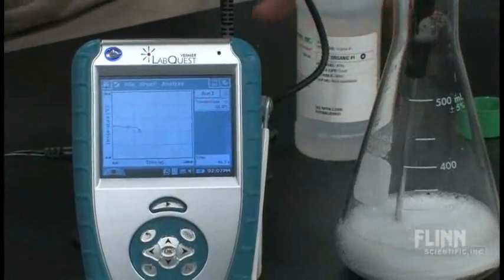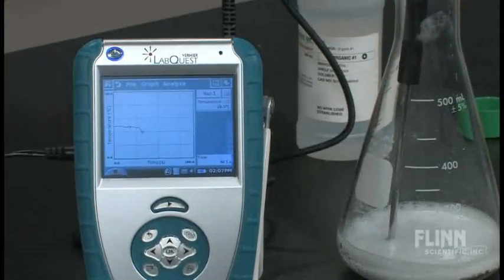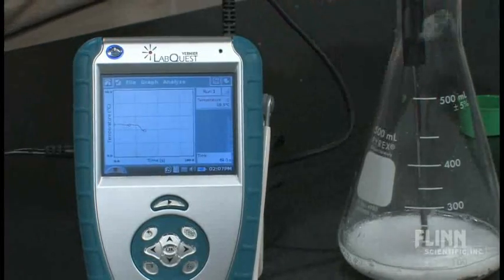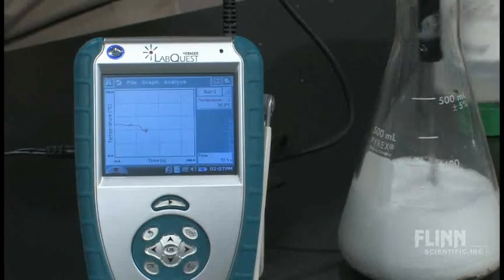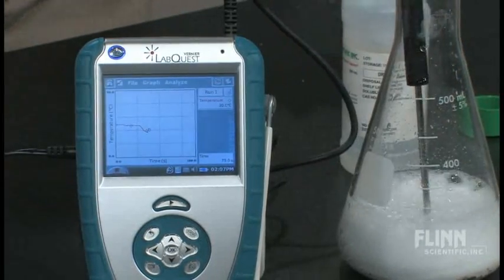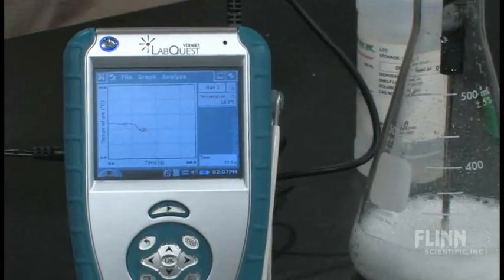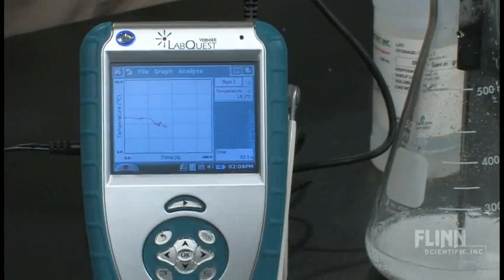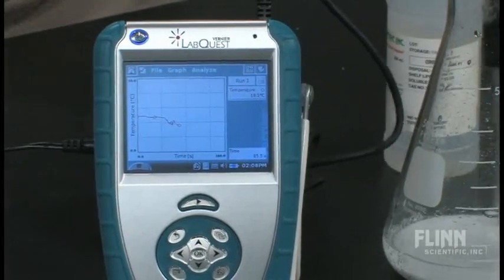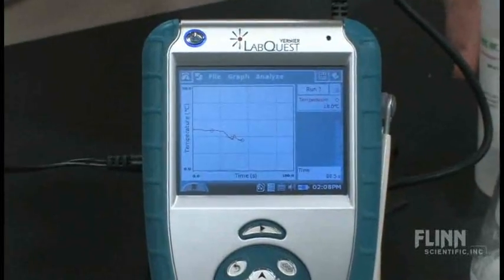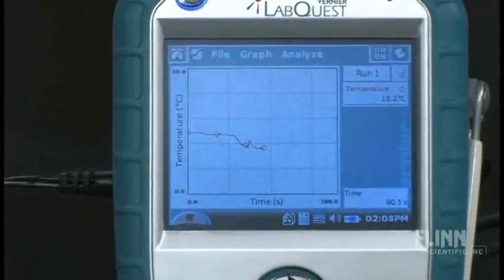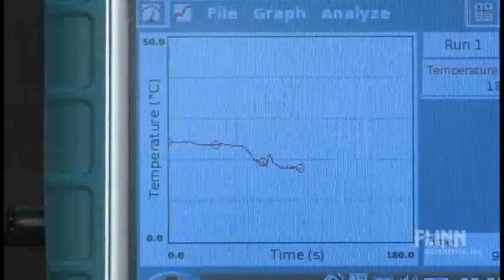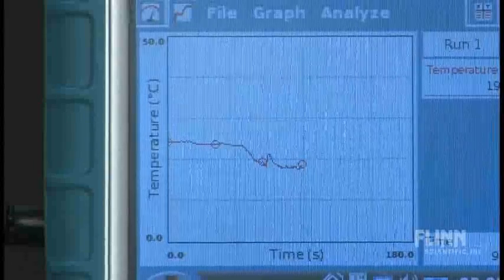Are we seeing some data being collected there? And surprisingly to the students, that temperature starts to drop. If you think about the prior knowledge they come into your classroom with — when they've seen things that have fizzed and bubbled, they've felt it and it's going to feel hot. Not in this case. In this case, the reaction is absorbing energy. It's an endothermic reaction. We call that a discrepant event. The thinking behind it goes beyond what they think they're seeing.